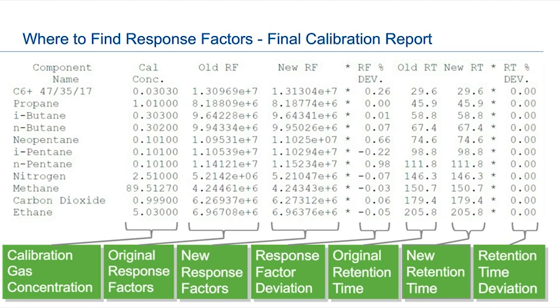Okay, and the other question I have is how to know the time period for calibration of an installed GC. Will the GC tell me when to calibrate? We don't actually cover that in this one. We're going to have a webinar on June 12th on calibration gases. But what's the time period to calibrate your GC? That depends. If you are pipeline, then generally you have tariffs or a specification that tells you what your requirements are. There are also regulatory requirements.